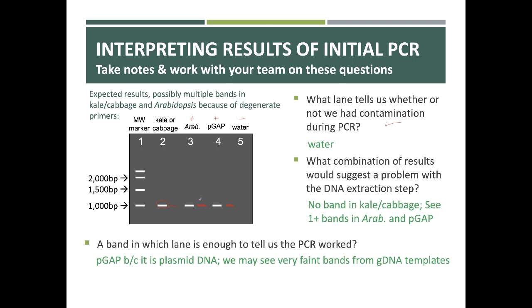You'd expect the one from Arabidopsis to work as well too, because remember that was the genomic DNA. But that has its own complications as well. So it's possible you would see a band here. But if you saw one here, you would say, yeah, PCR is a rock star and it worked perfectly well.